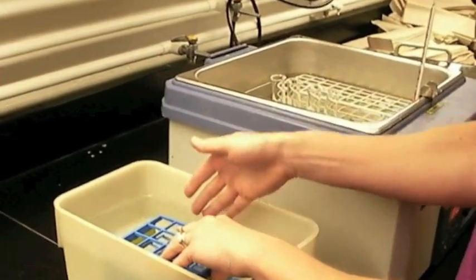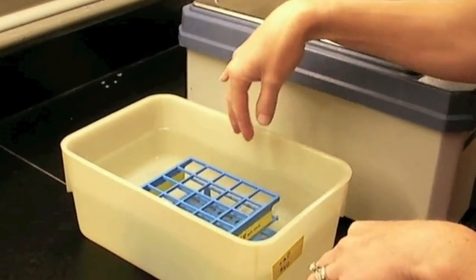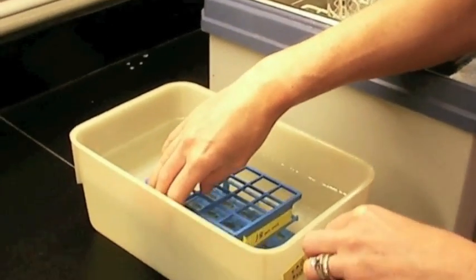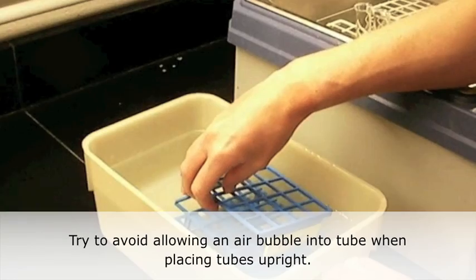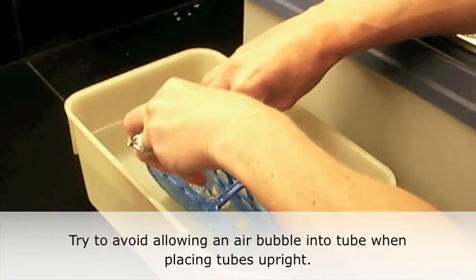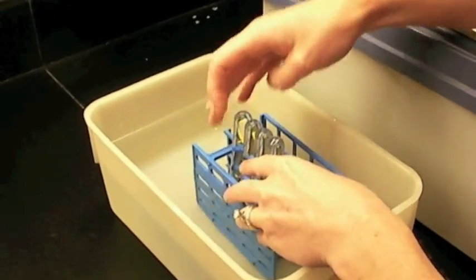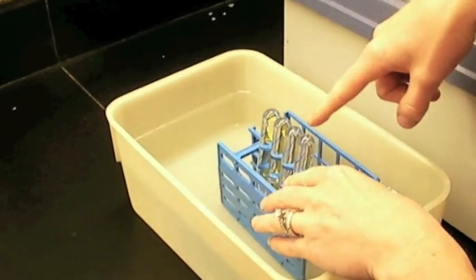Alright, so horizontally I have put all of the tubes down in the water bath, and they all look like they are filled with water. Now, keeping the tubes inside the test tube rack for support, I'm going to flip the tubes right side up, and they should be filled all the way with water.